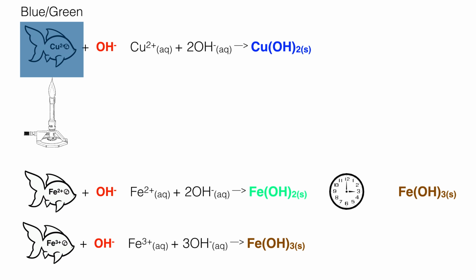So we've seen now the importance of the order that we test for these solutions. We have to eradicate lead before we then eradicate barium and calcium, and then we're free to add the hydroxide to test for the final 3 ions. If you don't get the order correct, you risk a false positive.